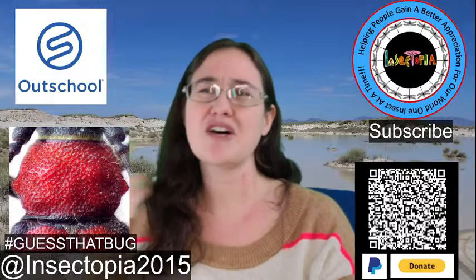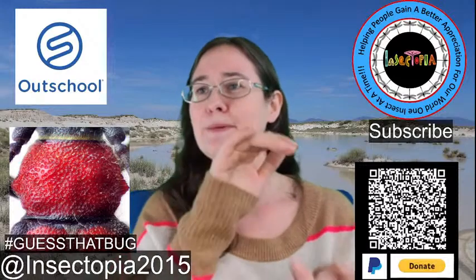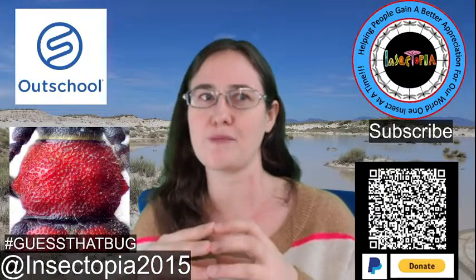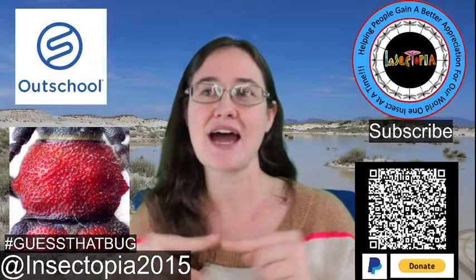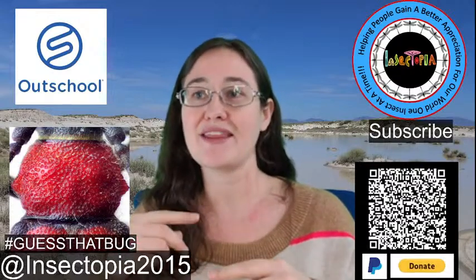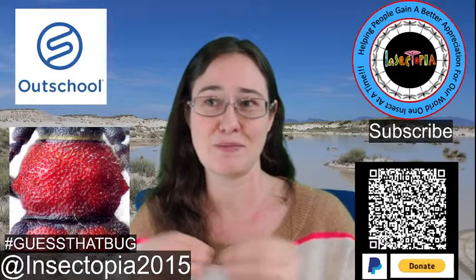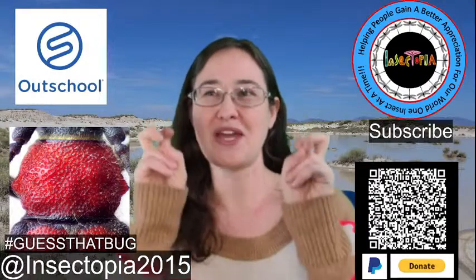Alcohol kill jars are another way. You can take any type of sealed jar, a sealed plastic jar or a sealed glass jar, and take a little cotton swab or a little bit of paper towel, and you can put nail polish remover on it, as long as it's non-acetone nail polish remover, because the main chemical in that is called ethyl acetate, and that's going to be something that will kill bugs semi-nicely. It kind of asphyxiates them. So we call them kill jars.